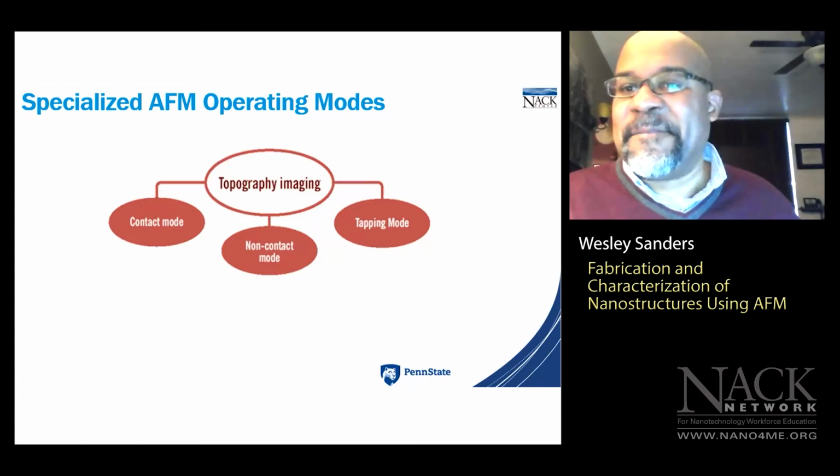And we also have 3D printing with lasers, where you can create all these sculptures. But again, like Wes was saying, they're going to be much larger than what AFM, or SPM in general, would offer. There might be some exceptional cases that I'm not familiar with, but I would say most likely they are not going to come out of direct writing or direct interaction with the laser beam, because it's going to be very tough to focus that into a certain region with a precision that's smaller than an AFM tip can do.